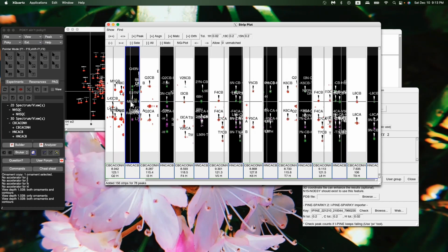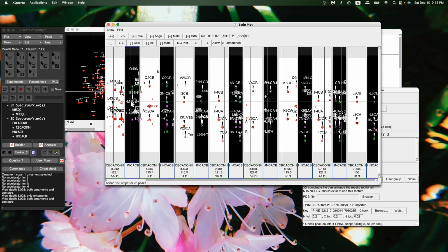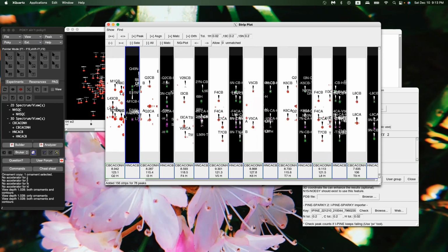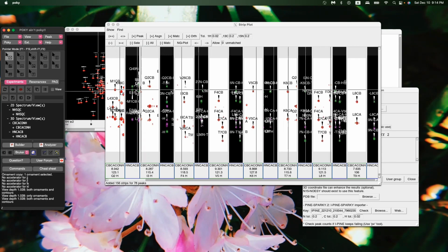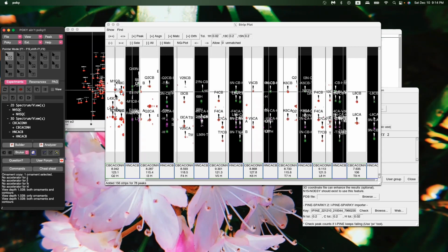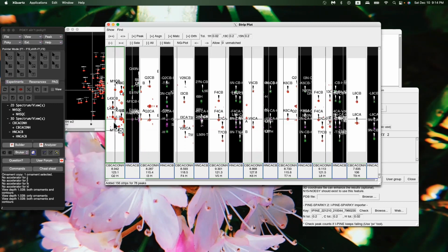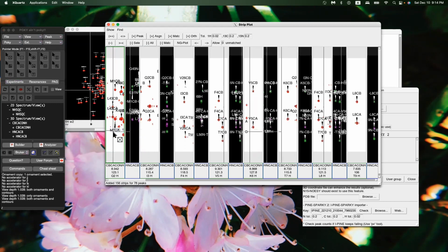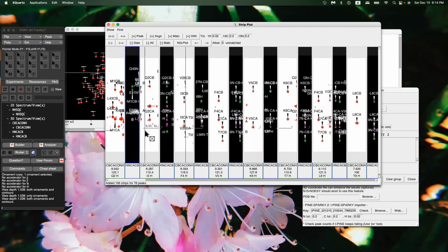The name is a bit long, so we can also minimize the name size. More information on how to adjust your name size can be found under the Help menu. But yes, this peak is here. And then if we look down this list right here, this is the one for this peak right here. We can move the labels around. This is for the M1 carbon alpha. And across from it is this peak right here. Let's see, is this label there?